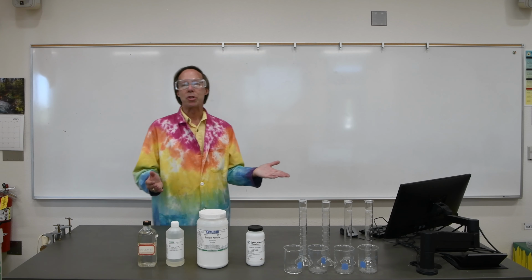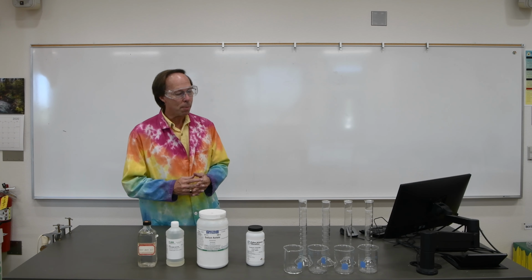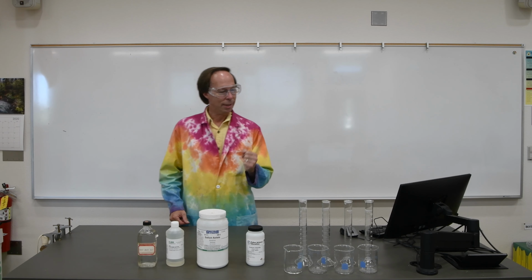So Part A we can skip for the moment. That's simply making our teams. Part B is the preparation of the solutions. So we're going to be making those 16 solutions.